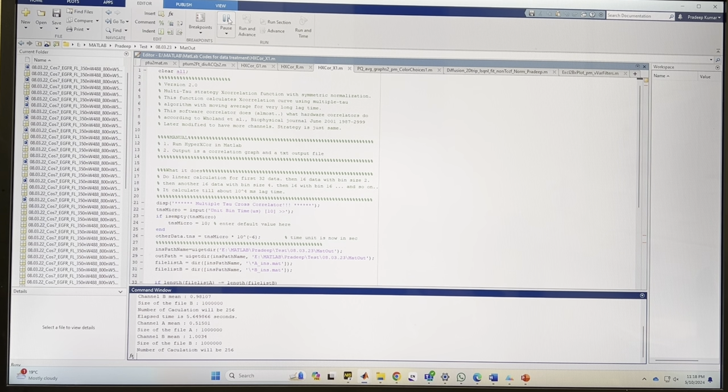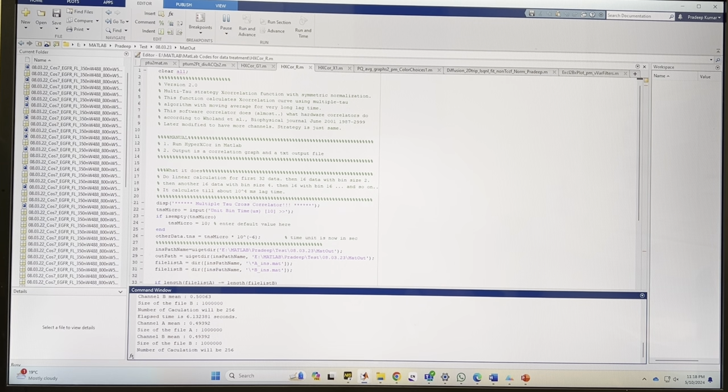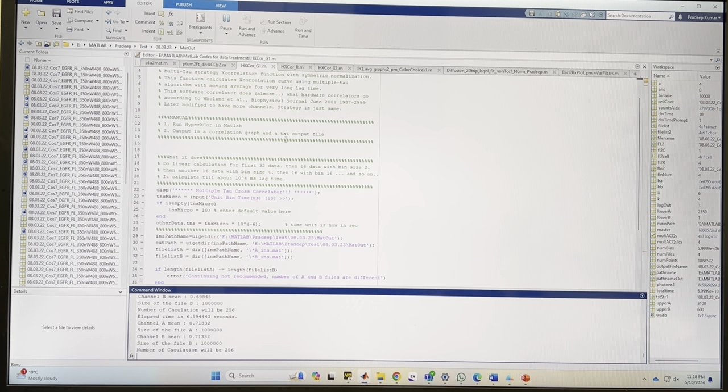So you can see here, it's just running now. I can check all 3 files running. It may take around 2 minutes because I have 4 readings. But when you are going to treat big data, like 40 readings for one data point, or for one experiment, we use around 80 to 100 cells, and right now I'm using only 4 different cells. So it may take a maximum of 2 minutes, but if you have 100 cells, it may take a couple of hours.